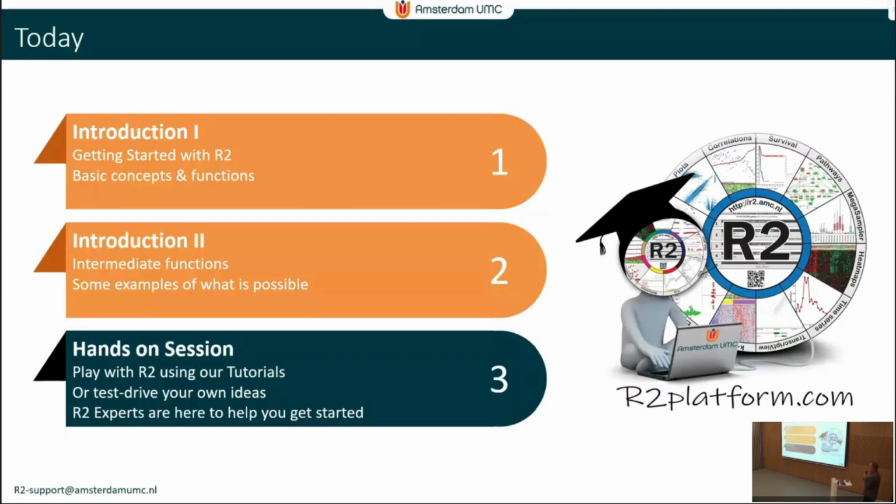So I've basically got around 1.5 to 2 hours of talking on what kind of things you can do in the platform. I will start with an introduction of how to get started, what it is, show you a little bit how you actually work in the platform, and then in the second hour I will go a little bit more into intermediate difficulty functions, and I'll show you a couple of examples of what is also possible without explicitly completely giving away how you do these kinds of things.